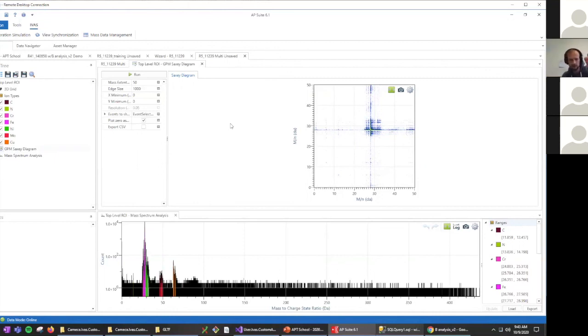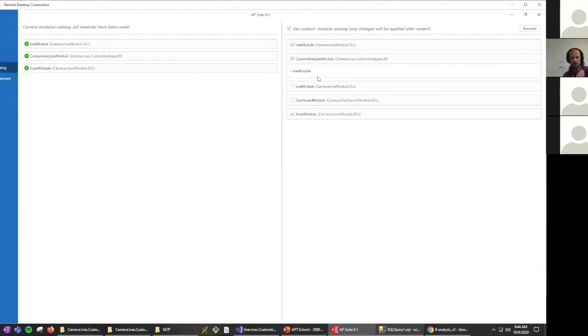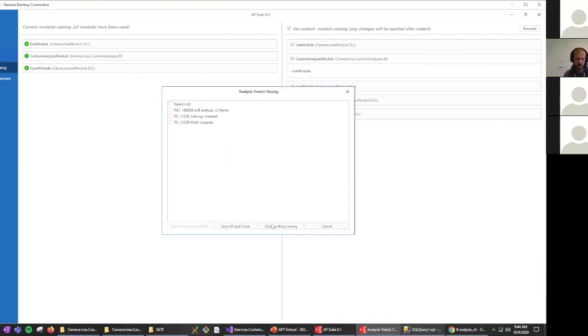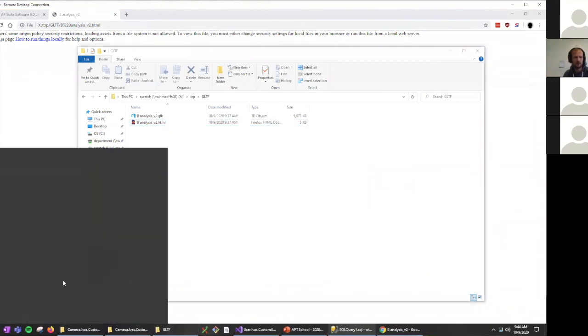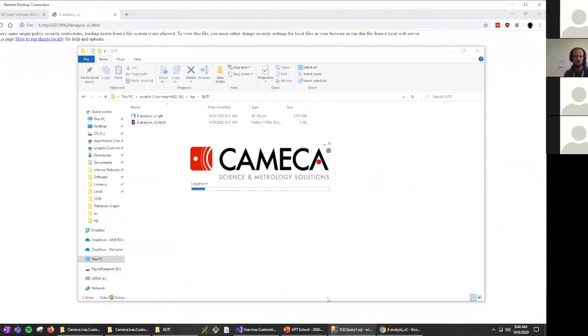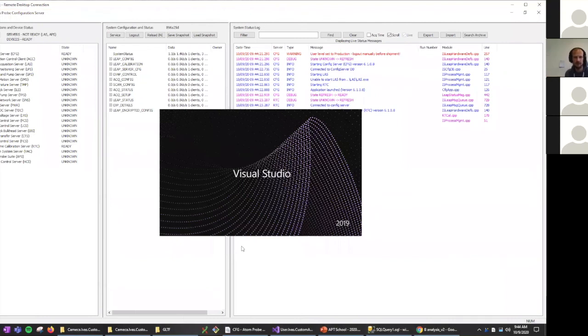analysis, measurement and analysis. And of course, several people would say, okay, but we want to have everything open. Some people would get insights into the detector technology. Some people would get insight into the details of the post-processing side, like, well, how is the isosurface computed and all the like. And you might always argue that with respect to FAIR, we should document data as completely as possible. And in that, typically you will have people who say, oh, but well, what is raw data and what is processed data different from raw data?